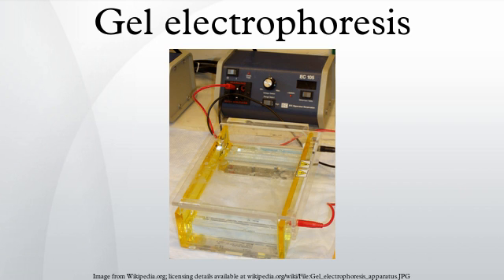Nucleic acids. In the case of nucleic acids, the direction of migration, from negative to positive electrodes, is due to the naturally occurring negative charge carried by their sugar-phosphate backbone. Double-stranded DNA fragments naturally behave as long rods, so their migration through the gel is relative to their size or, for cyclic fragments, their radius of gyration. Circular DNA such as plasmids, however, may show multiple bands. The speed of migration may depend on whether it is relaxed or supercoiled.